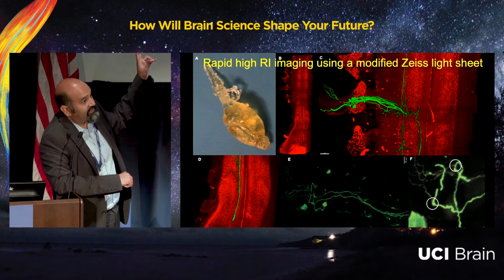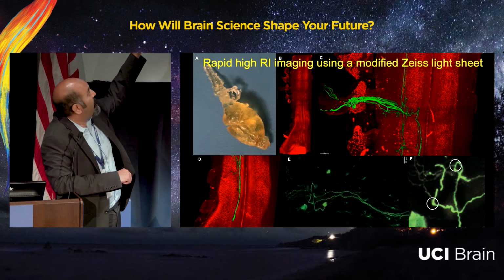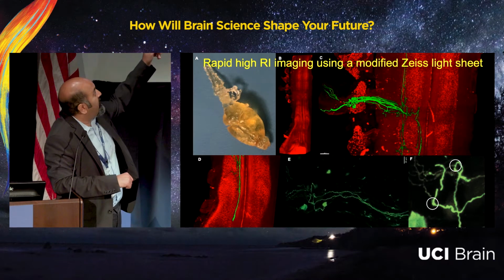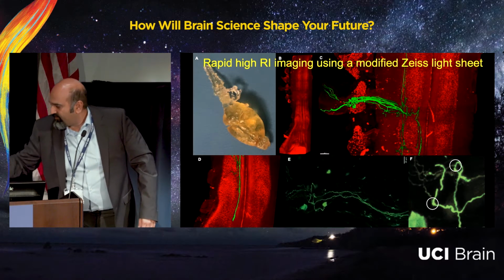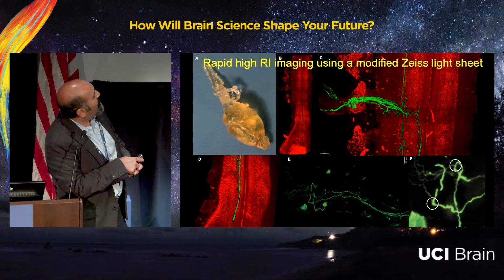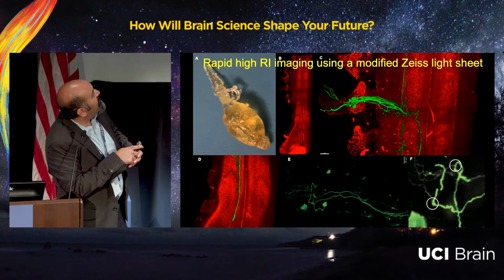So what you see here is a mouse brain and spinal cord kept intact. You may also notice that we've left intact one of the nerves off of the spinal cord. That's that winding tissue in this middle panel. I don't know if we have a pointer. I blind myself. Okay. In this panel here, you can see the fluorescence image taken with the light sheet of the cerebellum and brainstem, and then the spinal cord with a number of the cervical ganglia left intact.